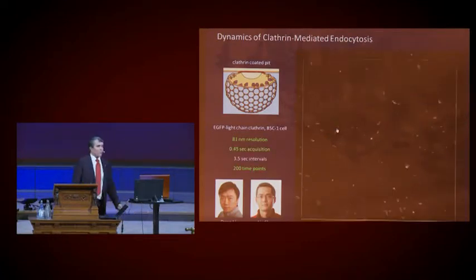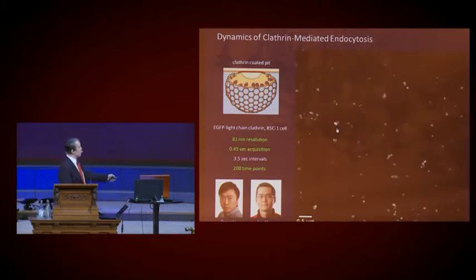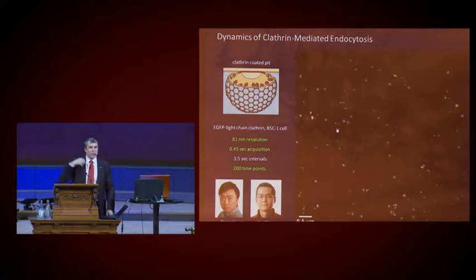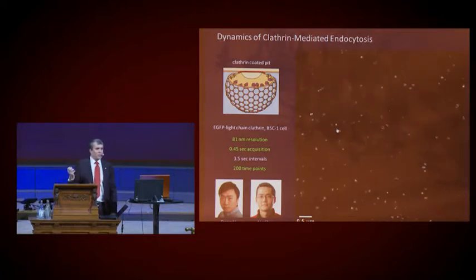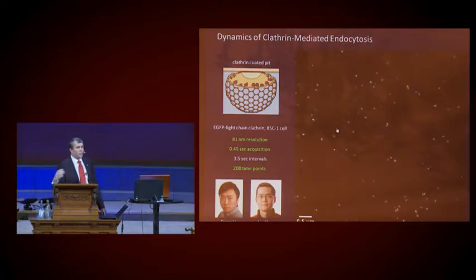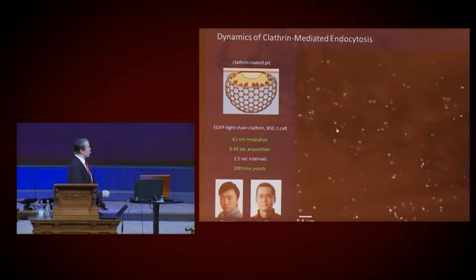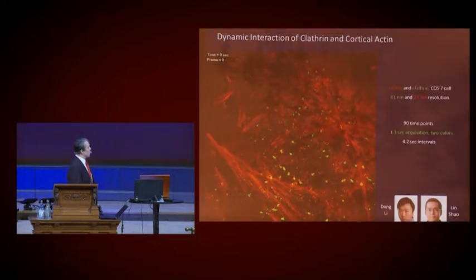But rather than just looking at them statically, you can look at them dynamically for a long period of time, and you can follow the entire course of the formation of these pits, their motion, their growth, and their eventual pinching off and internalization inside of the cell, again at high speed for many time points.